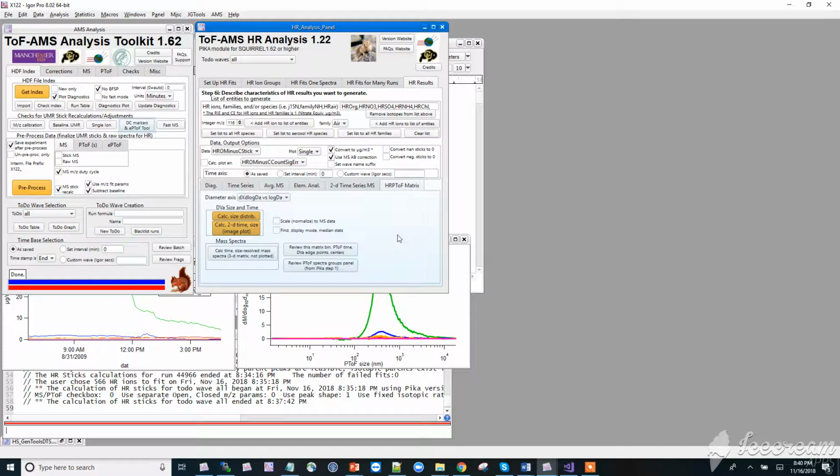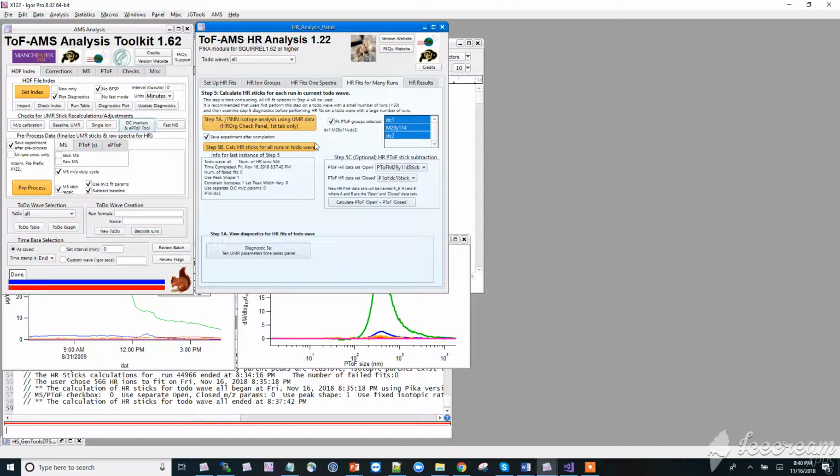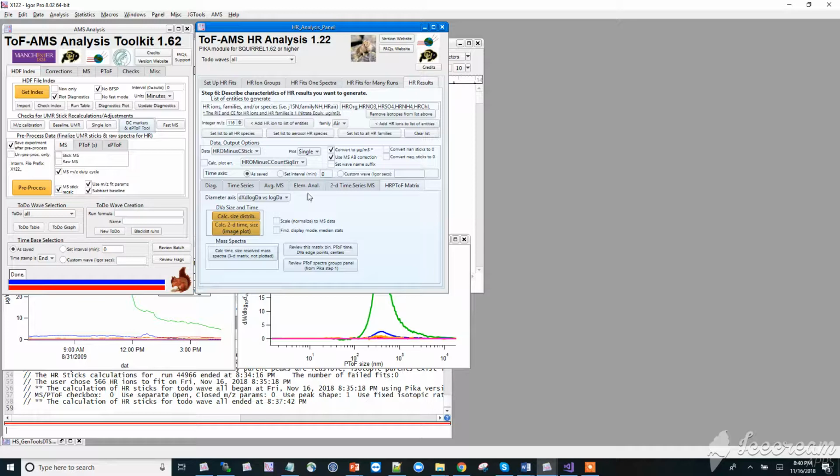This is the next in a series of videos of HR PToF data. I just finished fitting my high-res PToF data and subtracting, and I'm ready to plot the results. I am going to select in my drop-down box now.